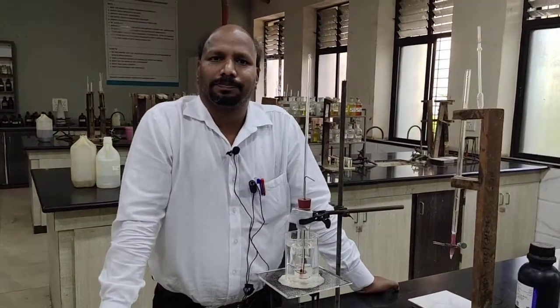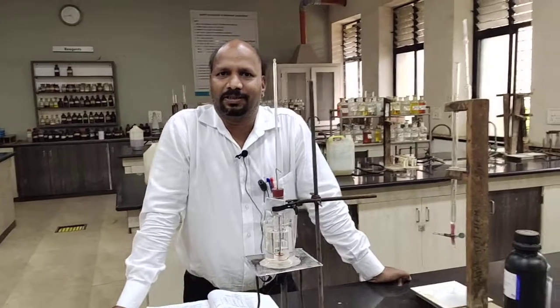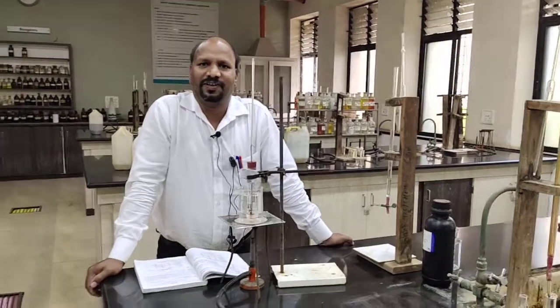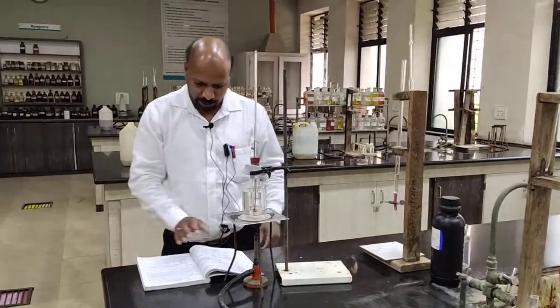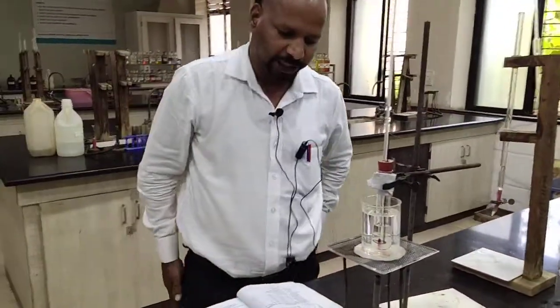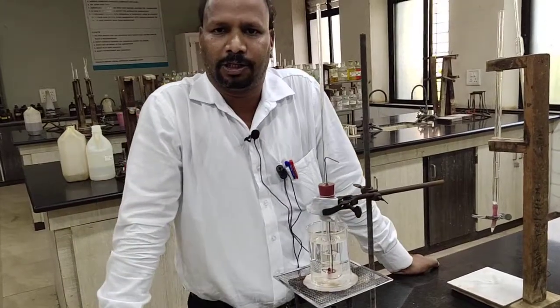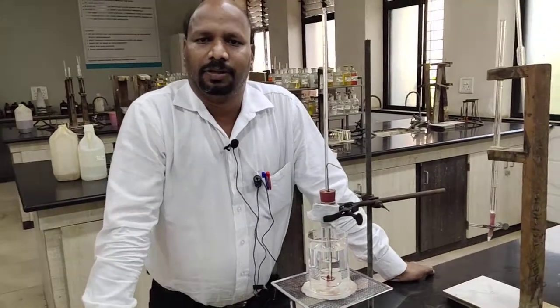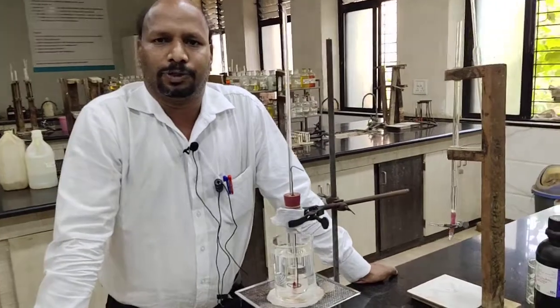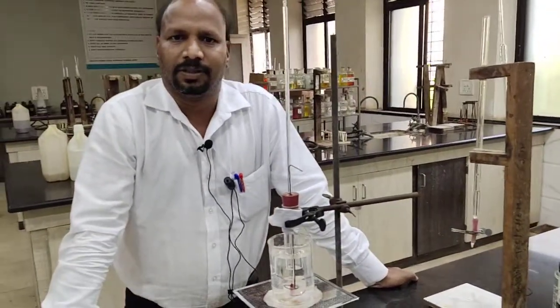In this practical we are going to take the third experiment, experiment number 3, the phenol water system. In the phenol water system, the aim of our experiment is to determine the critical solution temperature for the phenol water system. First of all we have to see the theory regarding this experiment.